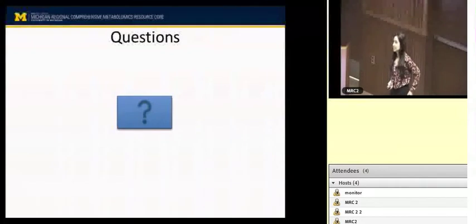I have two technical questions. Firstly, for the run order, you said it depends on the study design. Is there any kind of guideline on how to decide the run order? Oh, if you're sending it to us, you don't have to worry about deciding that run order. But yes, there are things to keep in mind.